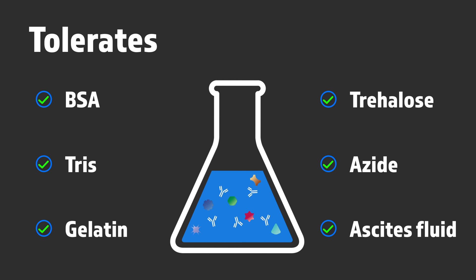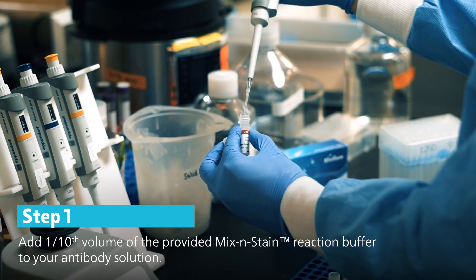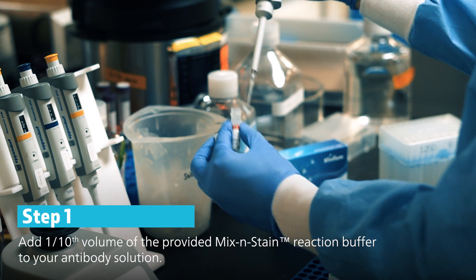Here's how you use it. With a pipette, add one-tenth volume of the provided Mix & Stain reaction buffer to your antibody solution.